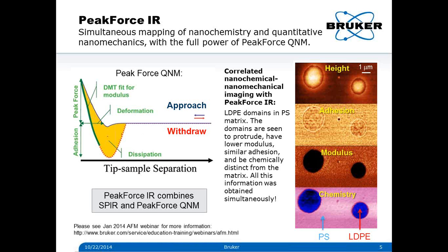I want to emphasize that this PeakForce technique is a technique where you can control the peak force in a very defined way. And that means you can do these kind of measurements combined with infrared mapping on samples that are fragile. We have measured suspended graphene. You can go to powders because you do not drag your samples around, which you would do in contact mode, which you would do, for example, also in tapping mode. So you don't need to worry about damaging your sample or changing your system that you want to investigate if you go to PeakForce infrared mapping.